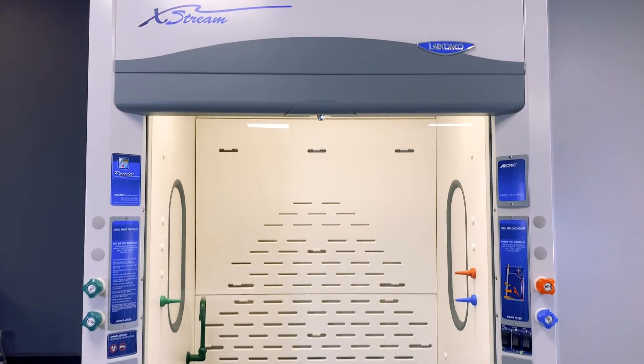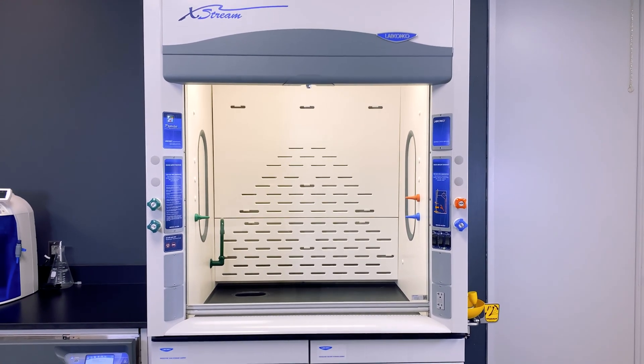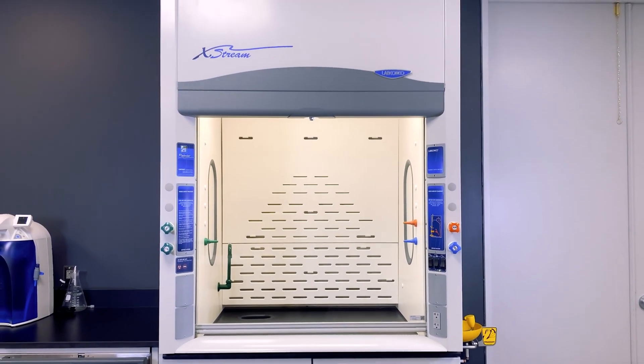Take protecting your laboratory environment seriously and pay attention to recommended practices when using any chemical fume hood.